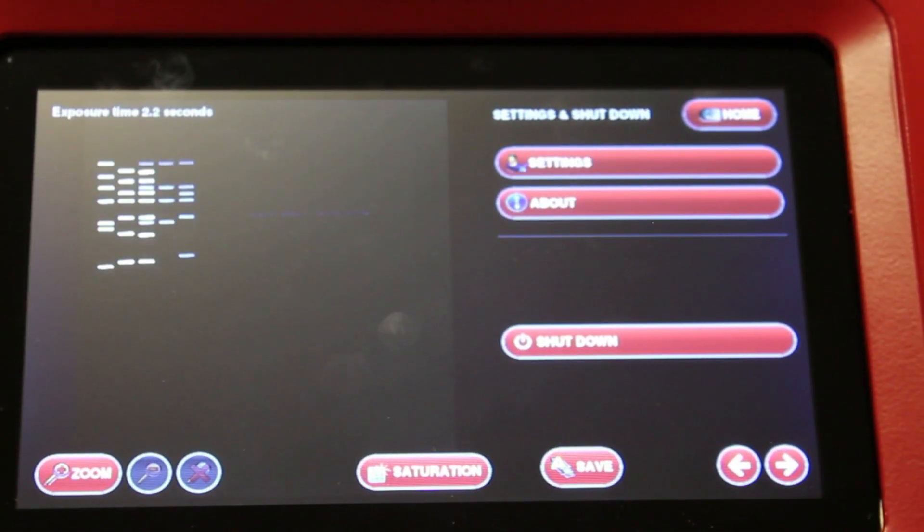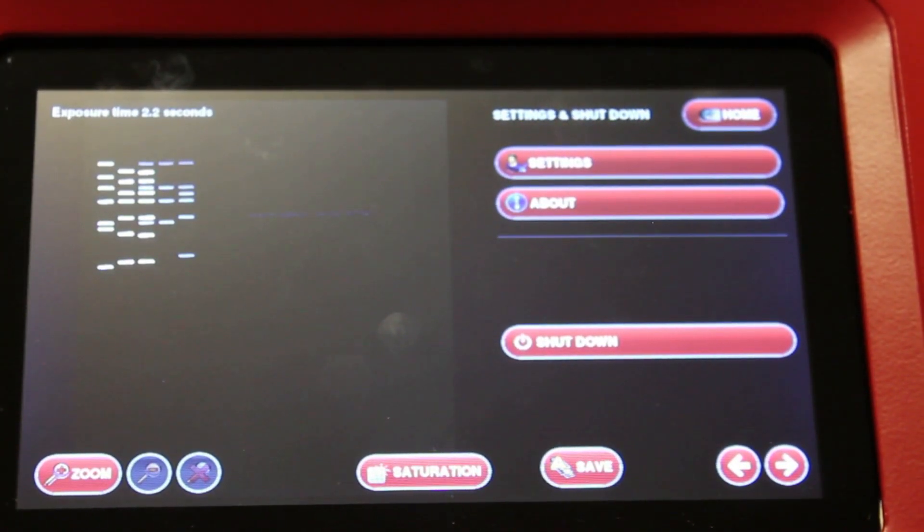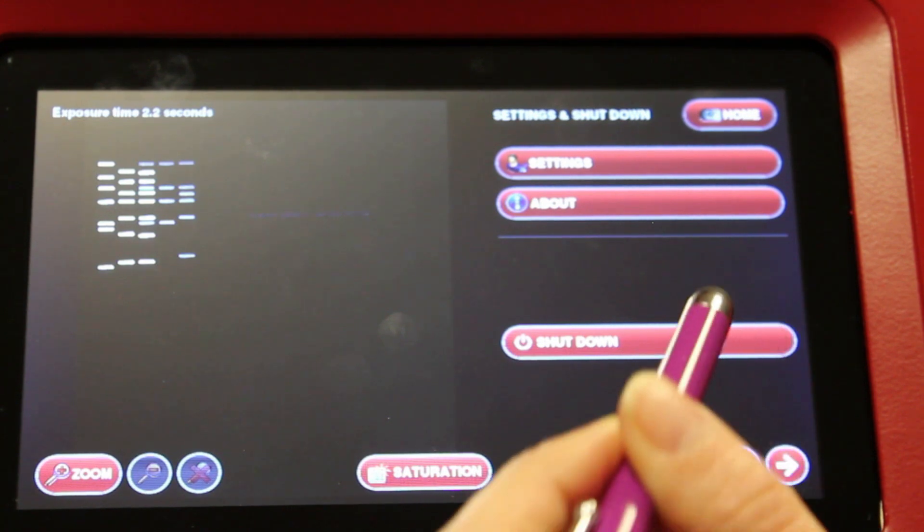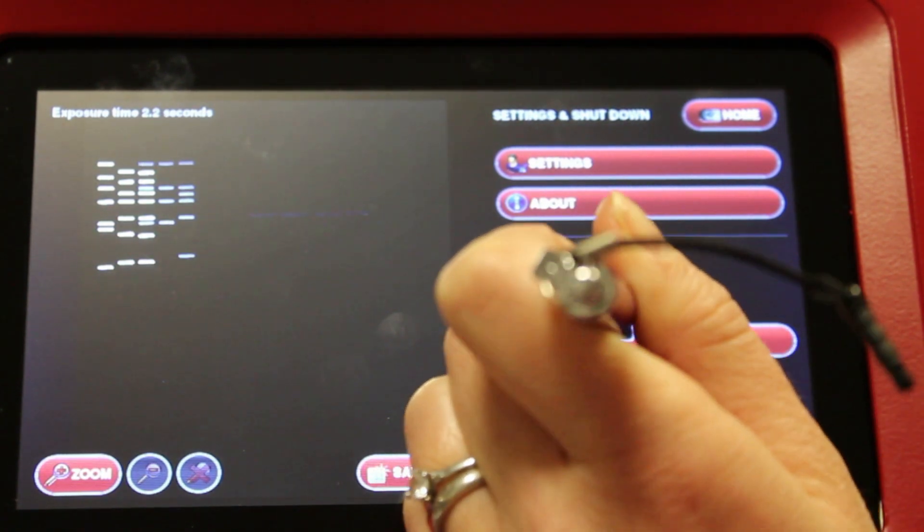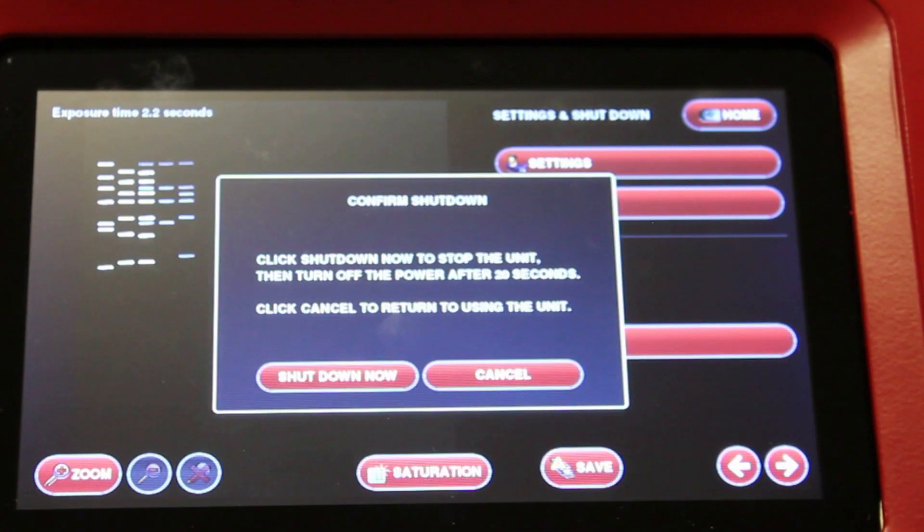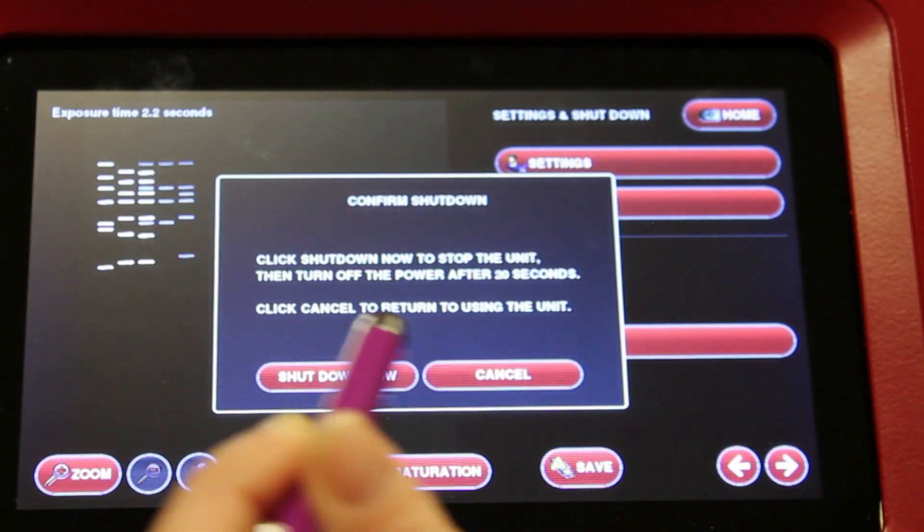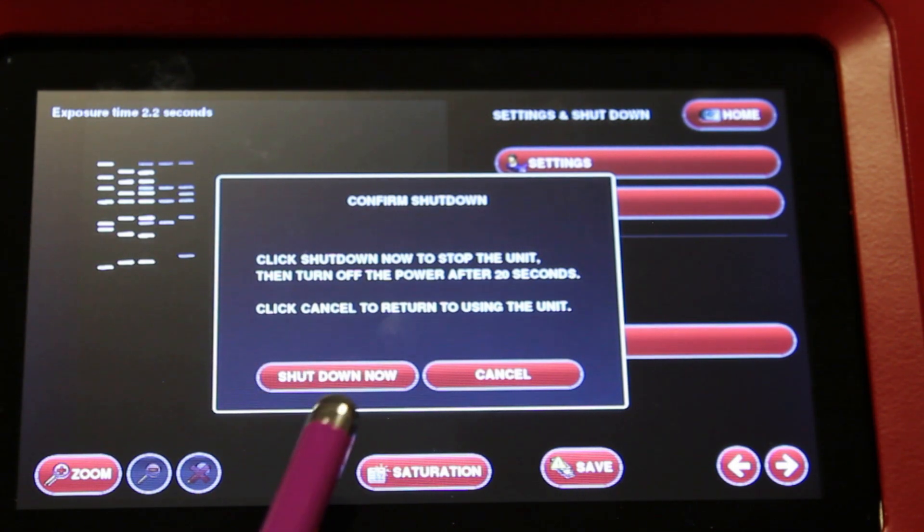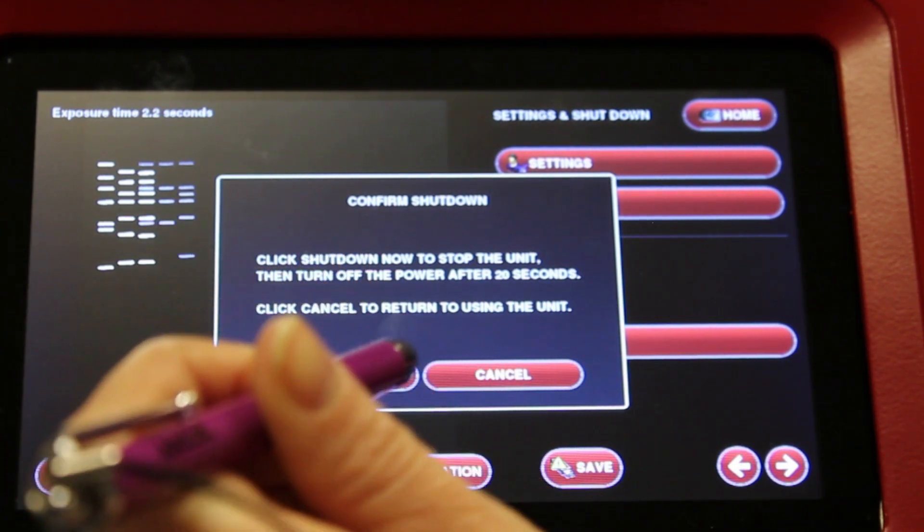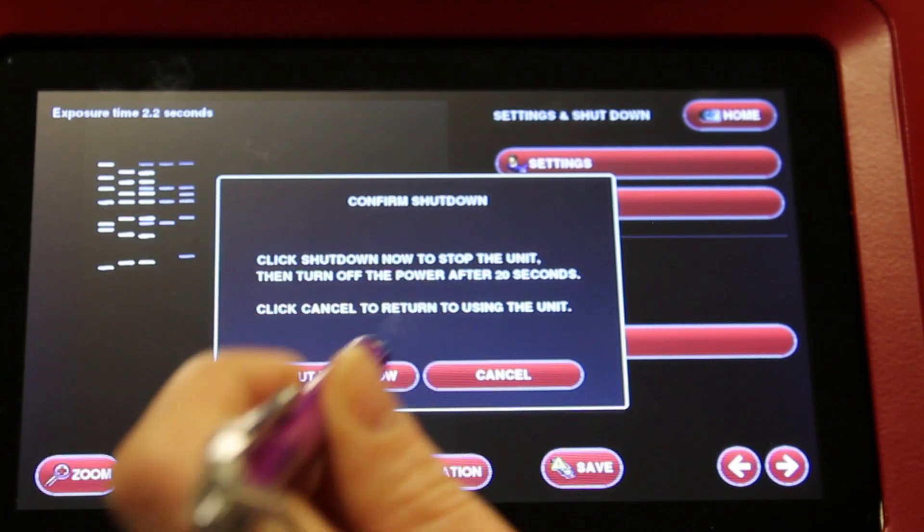When you finish using the Neugenius system, we recommend that you shut down the software using the shutdown button here, and then wait 20 seconds before turning off the unit at the back.